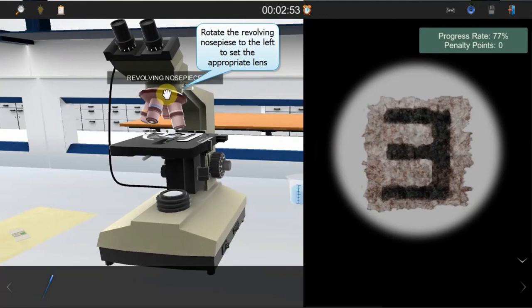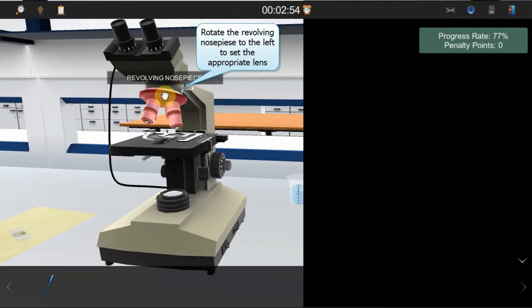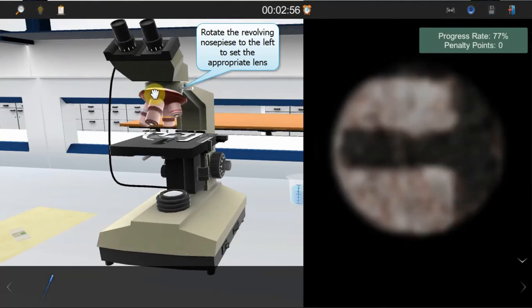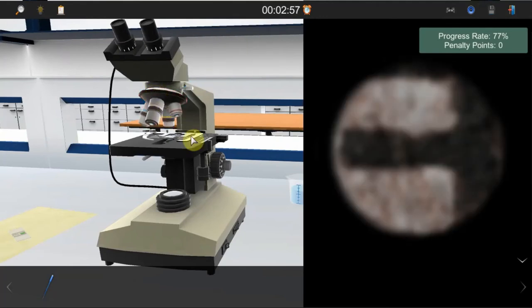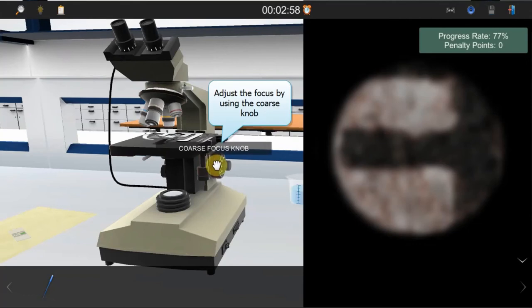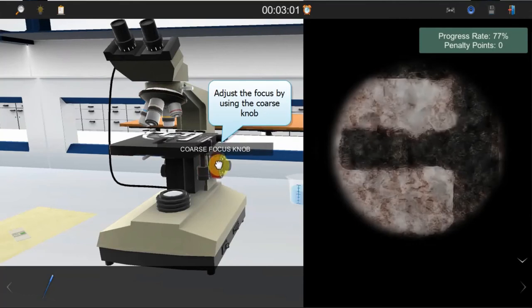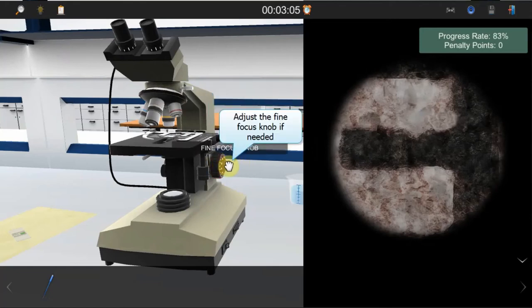Rotate the revolving nosepiece to the left to set the 10x objective lens into position. Now try to focus on the specimen by using the coarse focus knob. When the image becomes clear, use the fine focus knob for more adjustments.